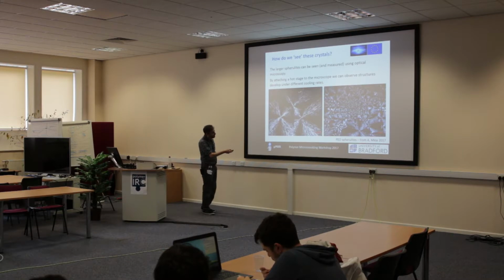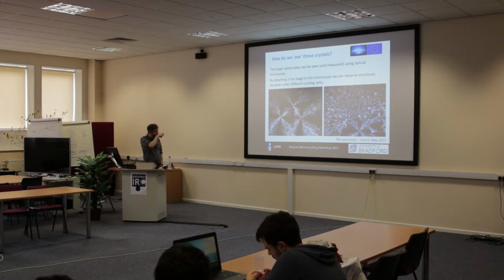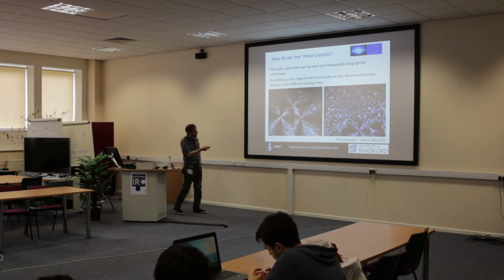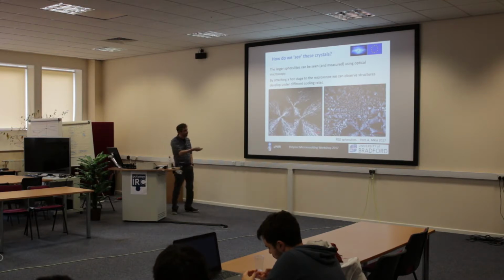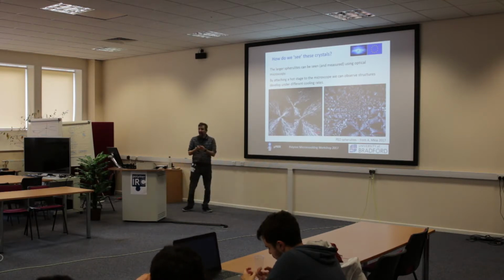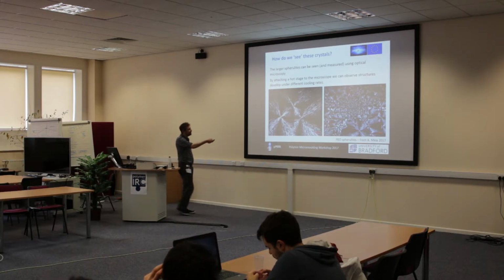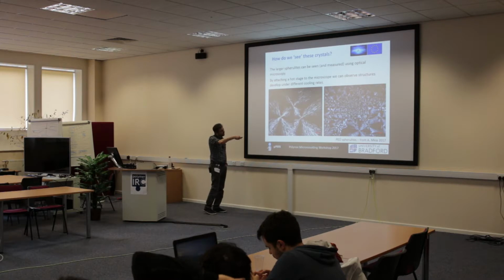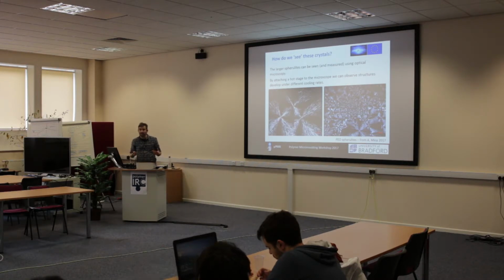So this is the growth. So this bar here, which you can just about read, is 100 micron, 0.1 of a millimeter. These spherulites have grown from nucleation points, okay, under cooling. So we're cooling the material down, a thin film, looking at it under a microscope. It nucleates, and then it starts to grow. Now, what we're interested in is how we can control that, okay? But they will continue to grow until they meet another crystal, okay? And so you can see this boundary that forms between the spherulites. They're basically growing until they can grow no more because they've met another crystal, okay?